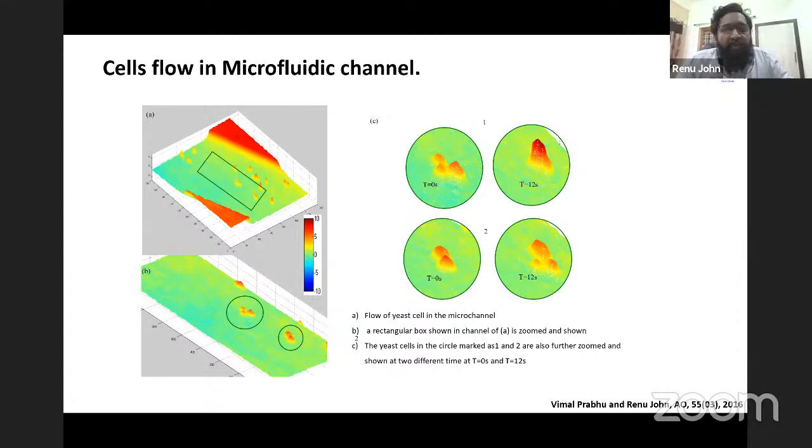So the advantage what we have really is that the object of your interest you can image in 3 dimensions in its depth and thickness, which would carry much more value than what you see under a regular microscope. And all of these things we can do in real time. We can do when the cells are live without having to stain or fix them. All right.